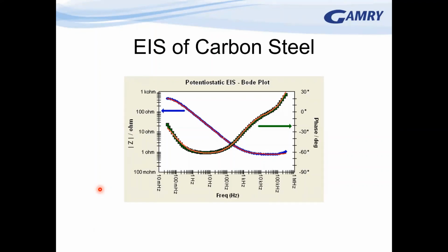I had another question. Can we use EFM in a two electrode mode? I mean, yes, you can use it. The problem with two electrode mode, and this applies to every measurement, is that you're measuring both the surfaces that are in contact with the solution. So you're measuring the corrosion rate or the current voltage behavior of both electrodes, and you can't separate out the two. So if they're identical electrodes, I guess you could do it. You just have to be careful about what you choose for your area, I think.